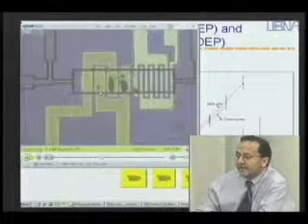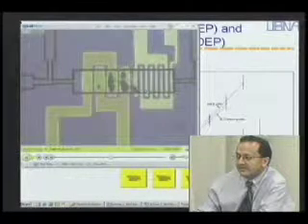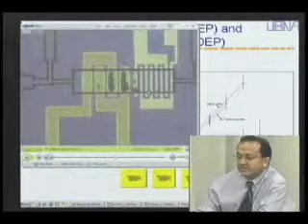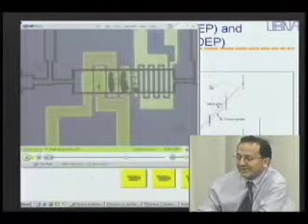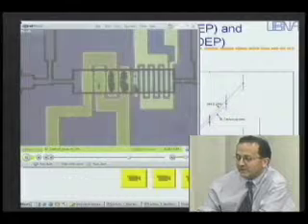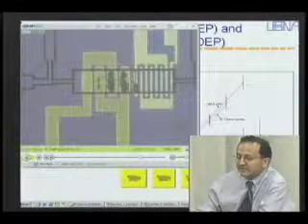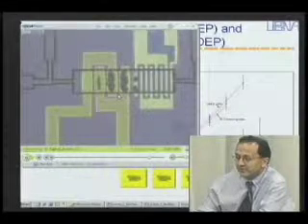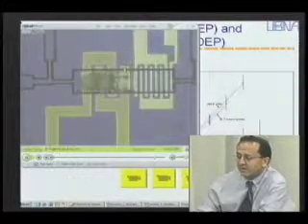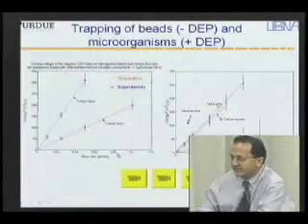In this case, the particles are all lined up in this flow line because you have laminar flow, and earlier in the device they were diverted to the edges of the chamber, and hence they stay in that flow line and continue to get accumulated here. When the voltage is turned off in just a few seconds, you will see that all of these trapped particles will then be released. Okay. So these are examples of dielectrophoresis that I wanted to show you earlier.